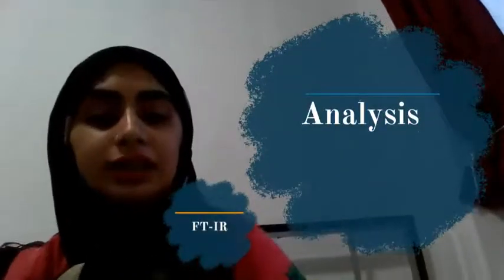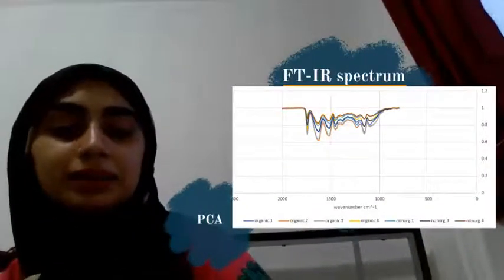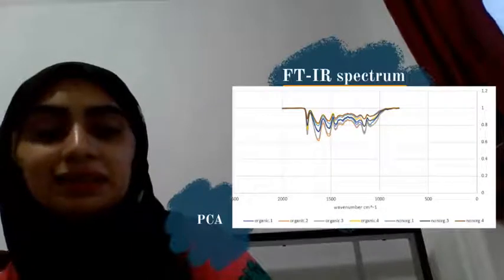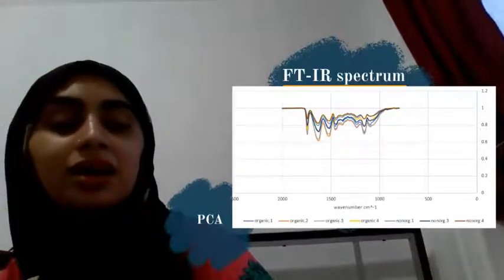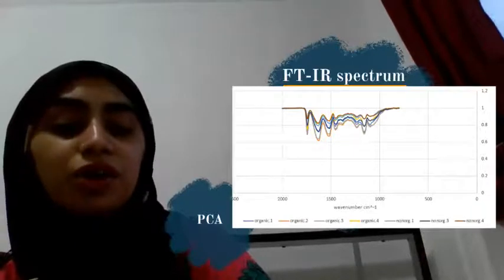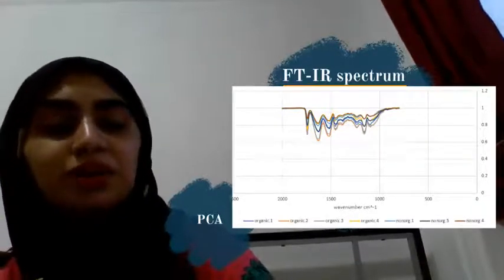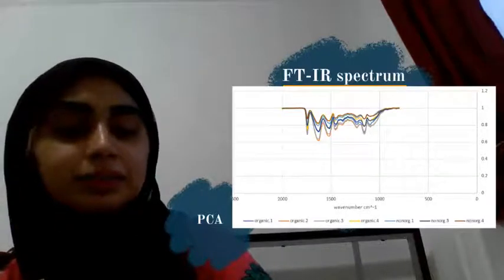Using the FTIR, we generated this graph model using our 7 samples. The area around 1700 to 1500 centimeters are the carbonyl peaks, while the area around 1500 to 400 is our fingerprint region. This region helps us to distinguish between the compounds in their samples.